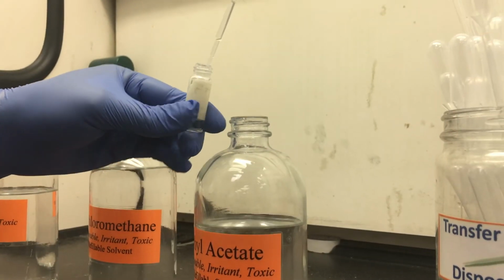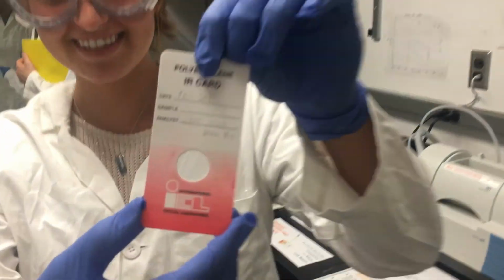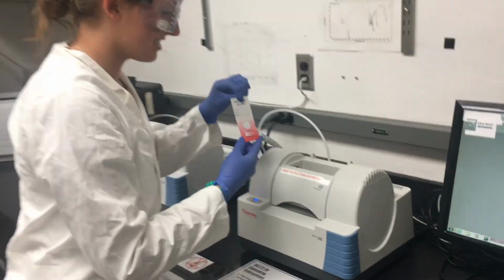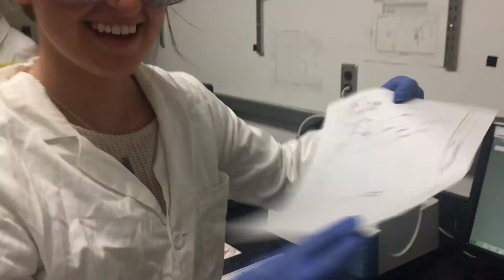Our fourth and final method for identification was FTIR. FTIR uses the differentiating characteristic of bonds present and not present within a molecule. Once again, we used this method to aid in determining the structure of the molecule in terms of what bonds there are.